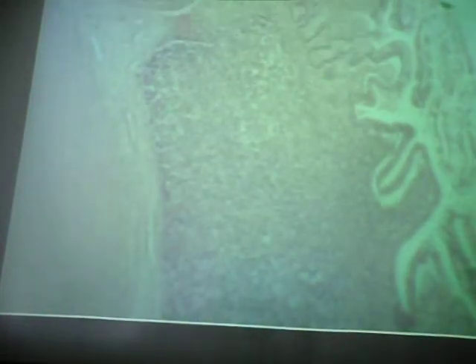And the mucosa is a type of membrane. It's a mucous membrane that lines many of the cavities in our organ systems: the GI tract, our respiratory tract, urinary, and reproductive. All lined with mucosa. You're going to see a lot of it. Mucosa always has an epithelium and then some connective tissue beneath it called lamina propria, which we'll talk about later. But here in the small intestine wall, we have some examples of MALT, and they have a specific name, which you should know. It's on your handout.